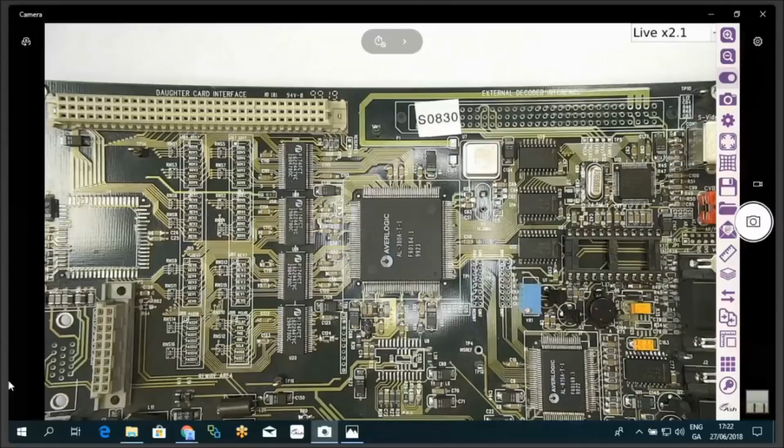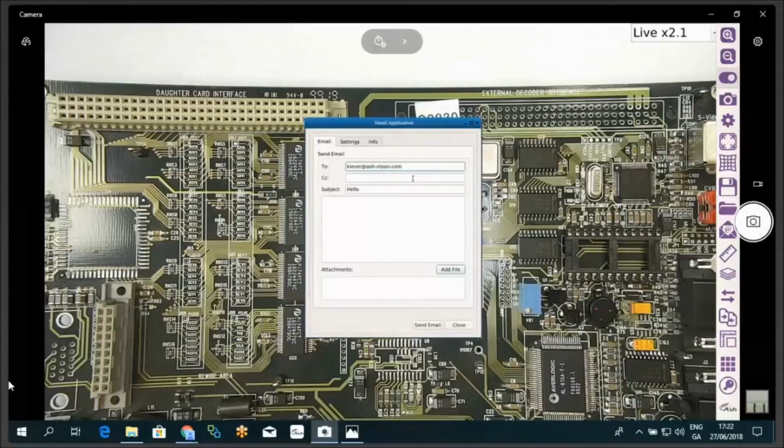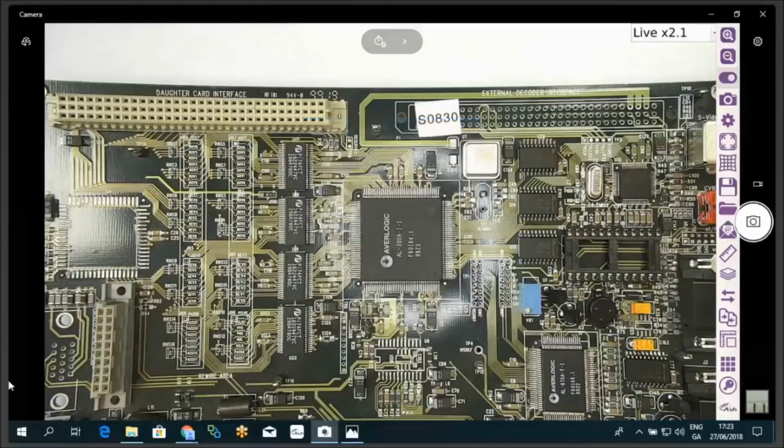Lens distortion comes with the standard model, the base model. Also, what comes with the base model is networking functions such as sending an email from a Gmail account. So you can send emails directly from the system. You just plug in your Ethernet cable, set up your account.